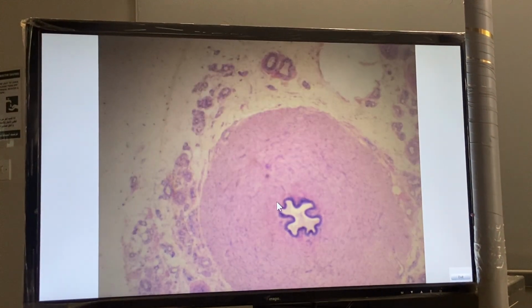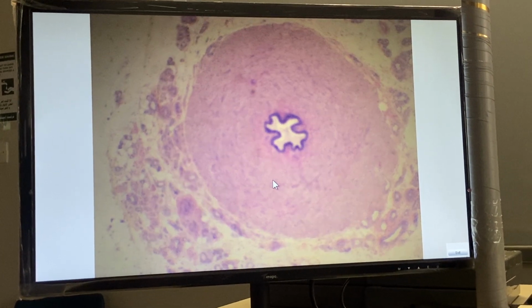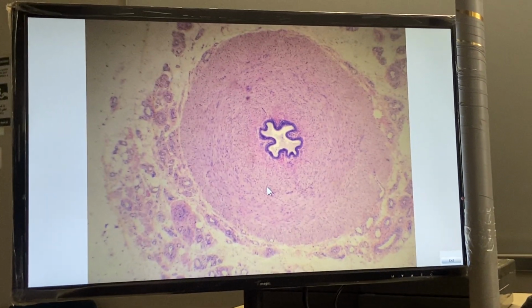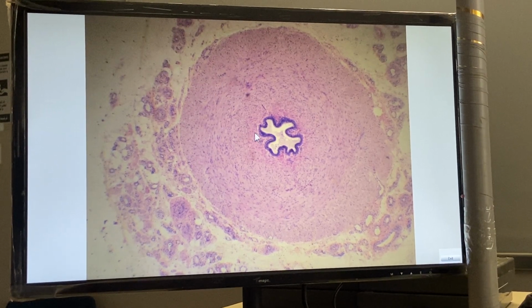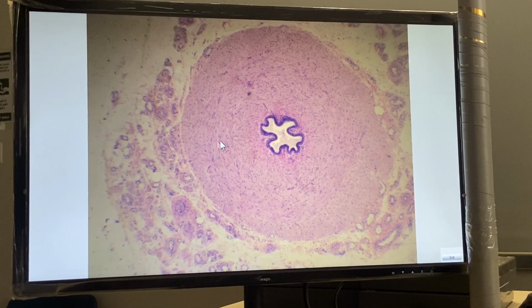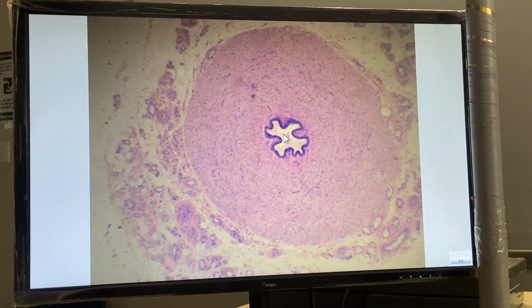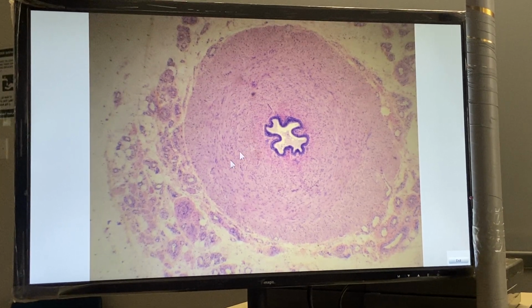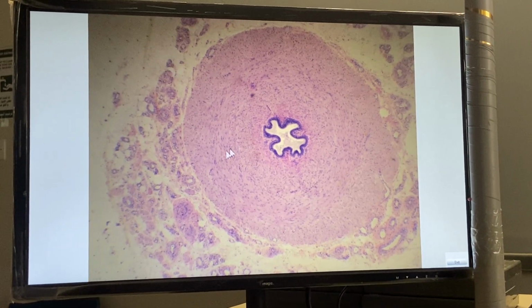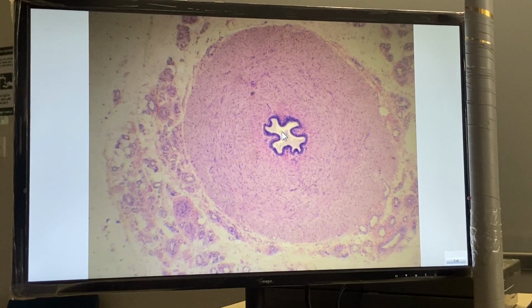This slide is a cross section in the vas deferens, or ductus deferens. The vas deferens is a long, straight tube with a thick muscular layer and a relatively small lumen. Vas deferens, or ductus deferens: thick muscular wall with a small lumen.